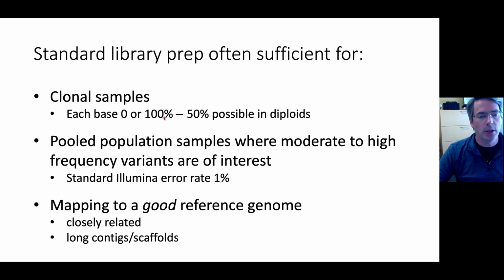Meaning when you map it to the genome, every base pair position should be all of your reads from your sample. If the genome position is a T, for example, all of your reads, if it matches the genome, should be T. Or if there's a mutation there, they should all be G, for example. They'll all be this, all your reads should be the same.